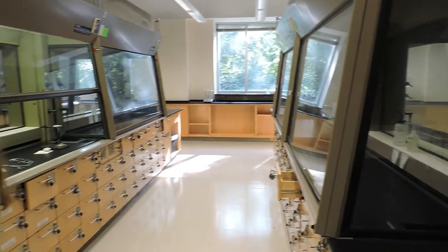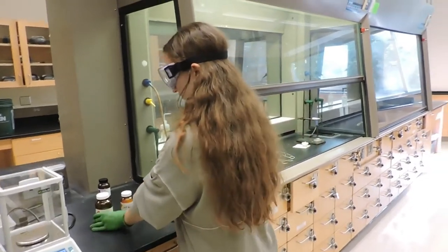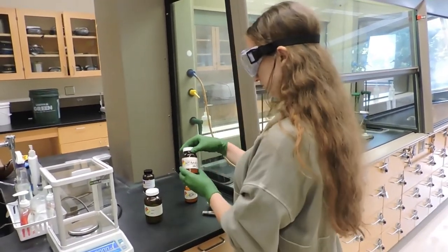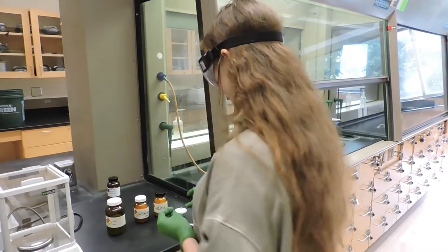All right, hello everyone. Today's lab is formula of a hydrate. Today we're going to determine the percentage of water in a copper sulfate pentahydrate, and then also determine the percentage of water in an unknown hydrate salt. After that, we'll calculate the water of crystallization for the unknown hydrate salt.